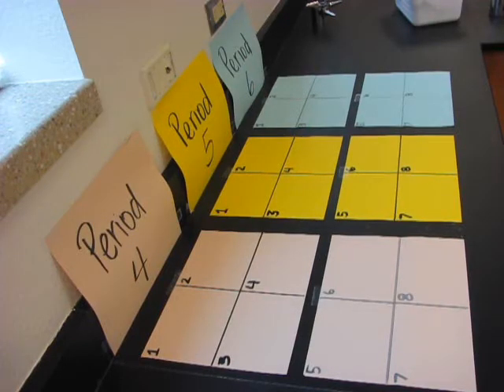At the end of day 1 and day 2, you will have to leave certain items over by the window area in order to let them dry overnight. Take a look at step number 9 from day 1. This one refers to leaving your beaker over by the papers. Period 4, your brown. Period 5, your yellow. And period 6, your blue.